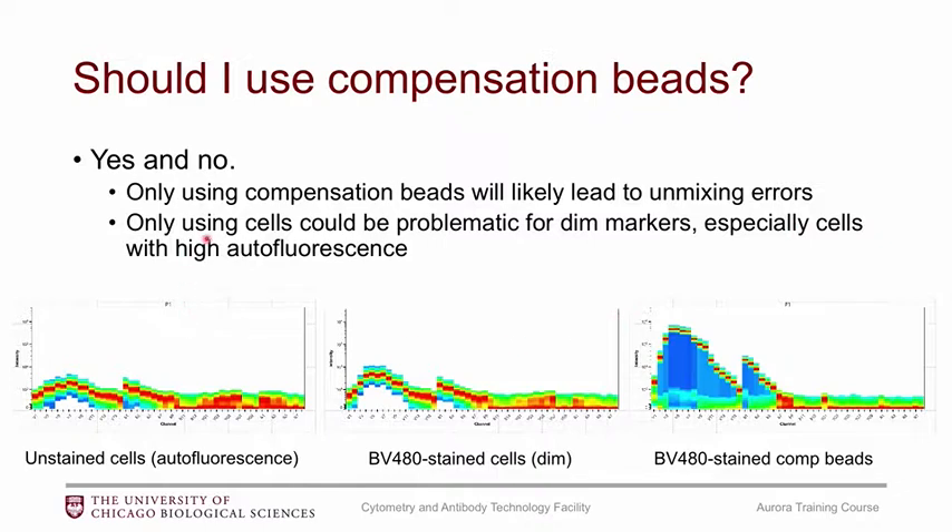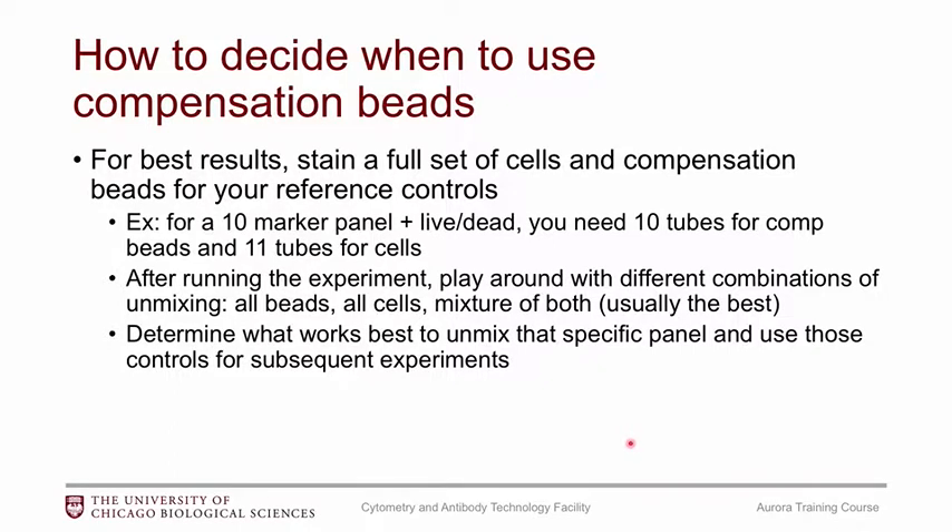But if you use only cells and have some dim markers in your panel, that can also be problematic, especially if your cells have high autofluorescence. For example, unstained cells with high autofluorescence compared to BV480 may show very little actual BV480 signature, whereas compensation beads give a very nice, clean signature. So for dim markers, compensation beads can be a great option.